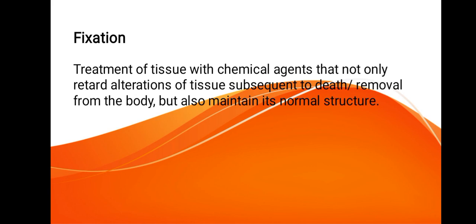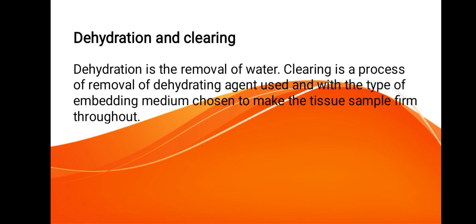We find that fixatives also lock into position a number of carbohydrate and fat containing macromolecules that otherwise would be lost during tissue processing. Fixation needs to be rapid enough to curtail release from dead cells of enzymes capable of digesting tissue constituents. Our next step is dehydration and clearing.